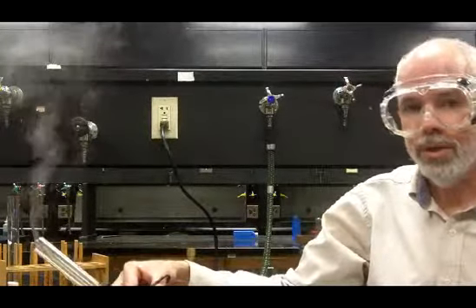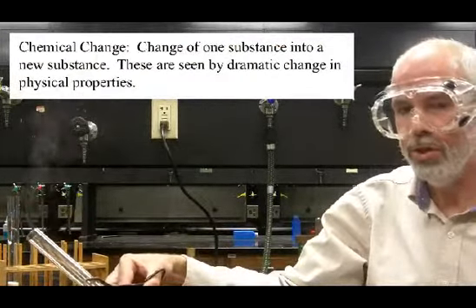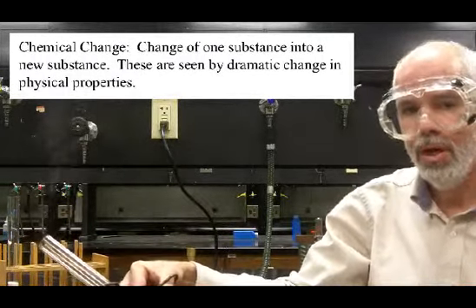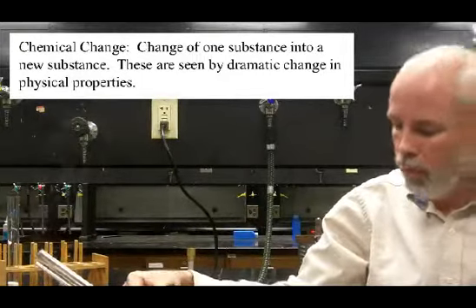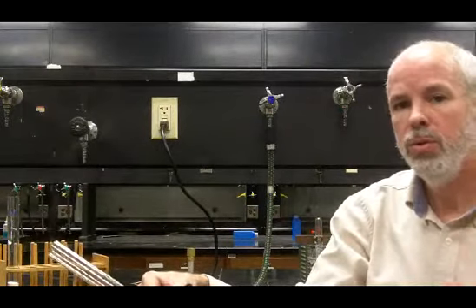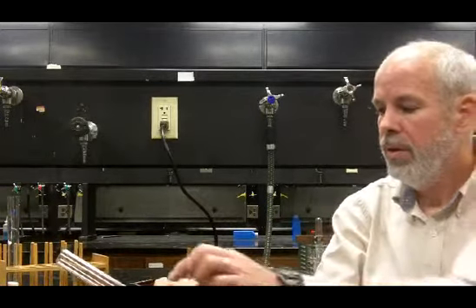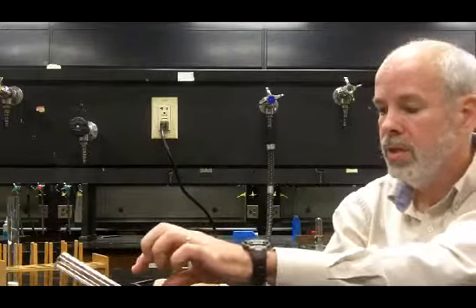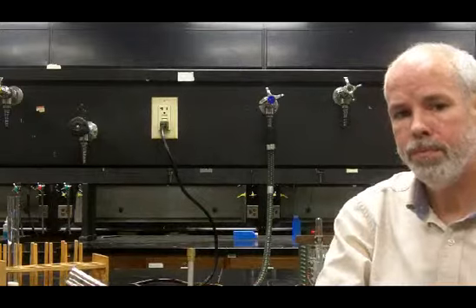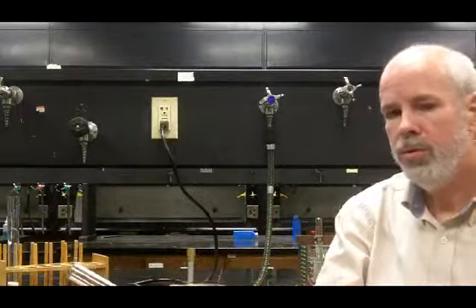So this looks like magic, but it's what we will call a chemical change. It's a change of one substance into a new substance which has completely different properties. What we want to focus on for this chemical change is that the sugar has changed into two new things. There's a black solid in the bottom, that's called carbon, and there's a clear liquid that's condensed along the sides of the test tube, and that is our very familiar water. What we want to concentrate on is that sugar can break into two new substances.